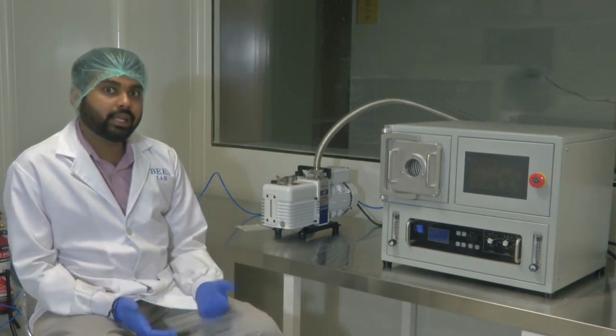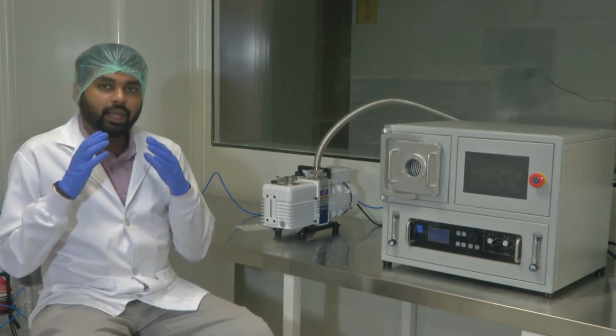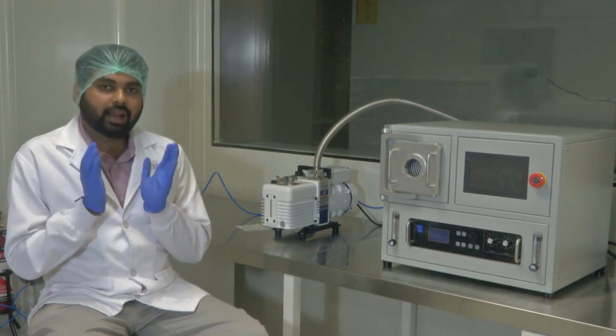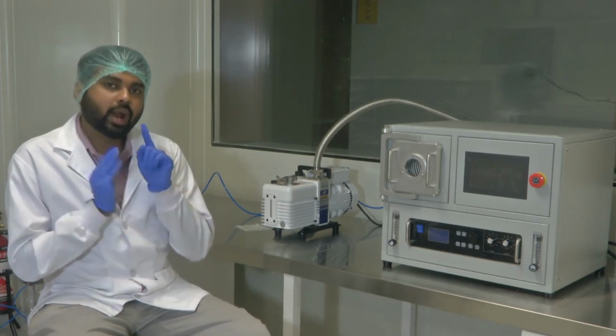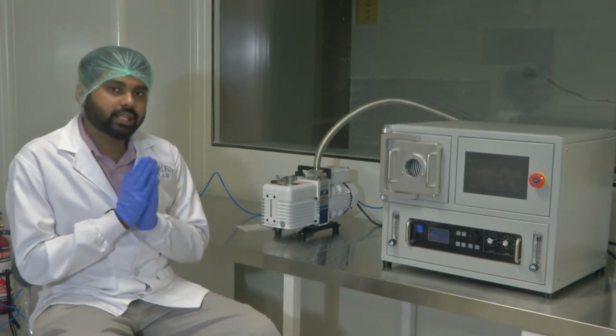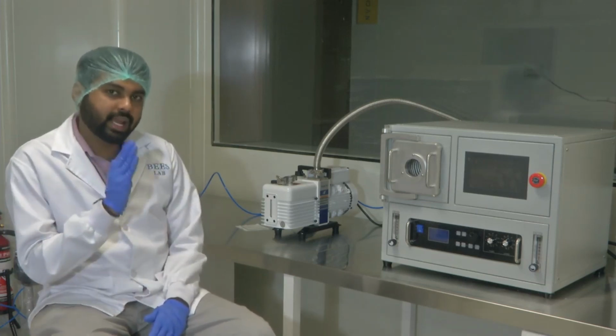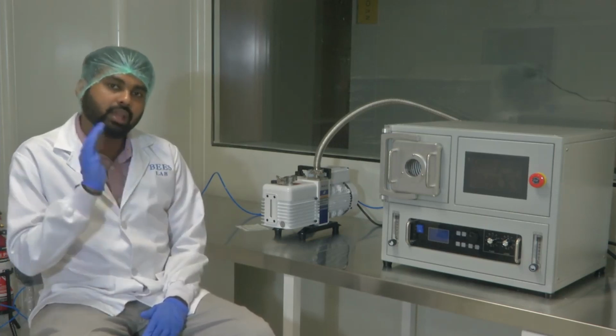And more importantly, the problem is that you apply a particular RF energy. If it's one species of gas that is there, you know what RF energy you have to apply for it to become plasma. When I show you, you will see that exactly after a particular RF power, it becomes a plasma.